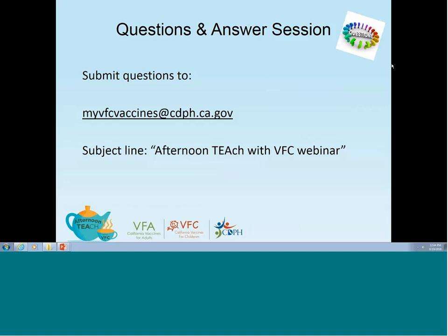Every 2 weeks, do we fax the logs, or do we just download in our PC? And I love this question, and I hope this will help out a lot of staff out there. Please download and save your files to a computer. There's no need for you to fax anything to us. We want you to save that data. We want you to save it in a way so that it's accessible to all staff, and even those of us from the California VFC program.